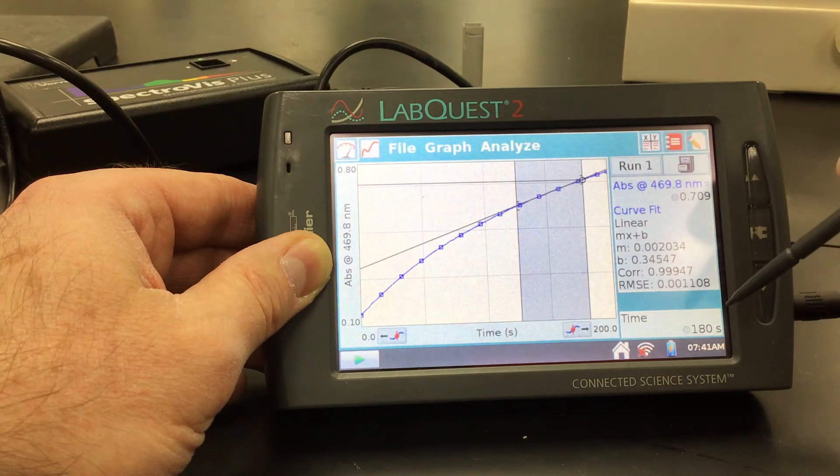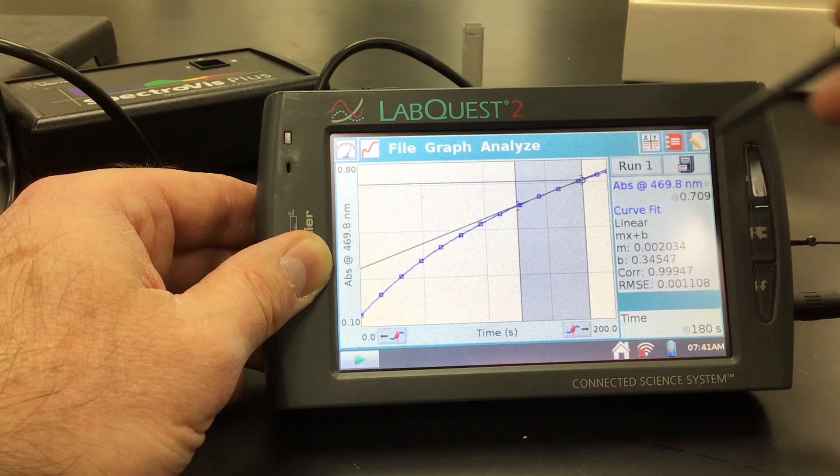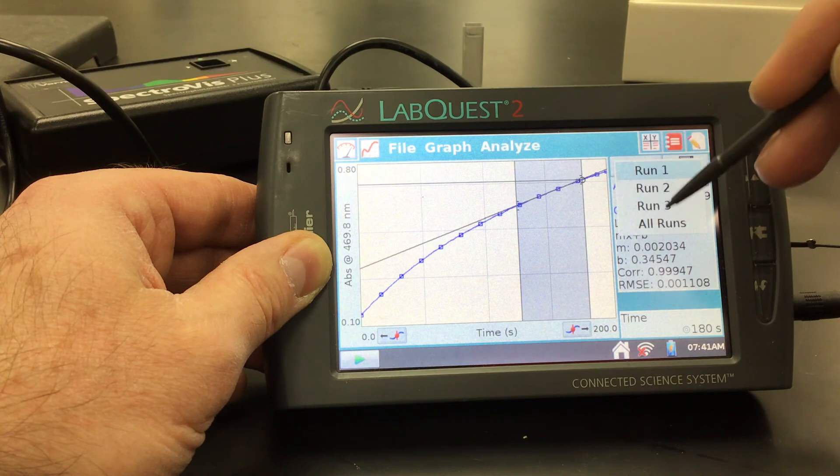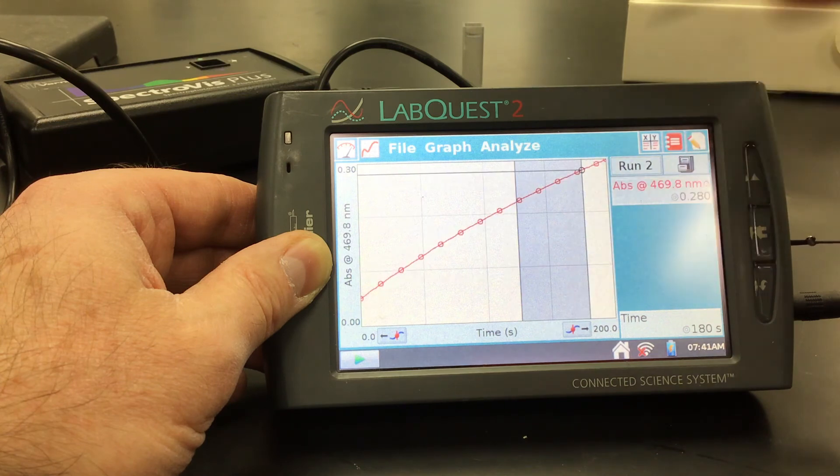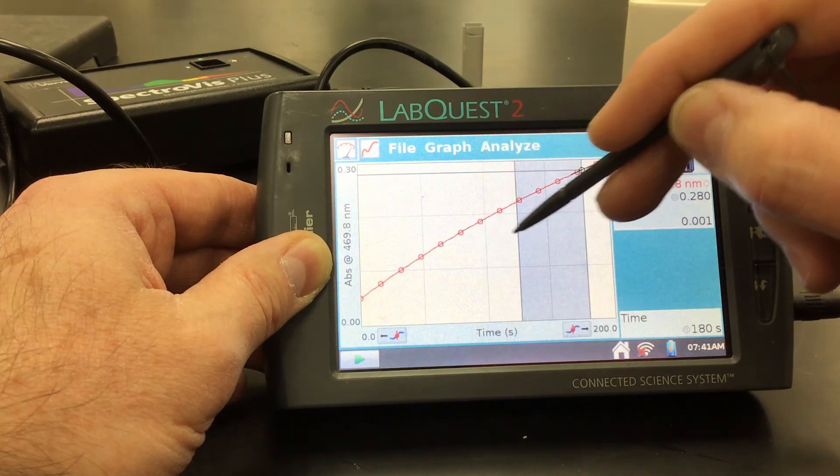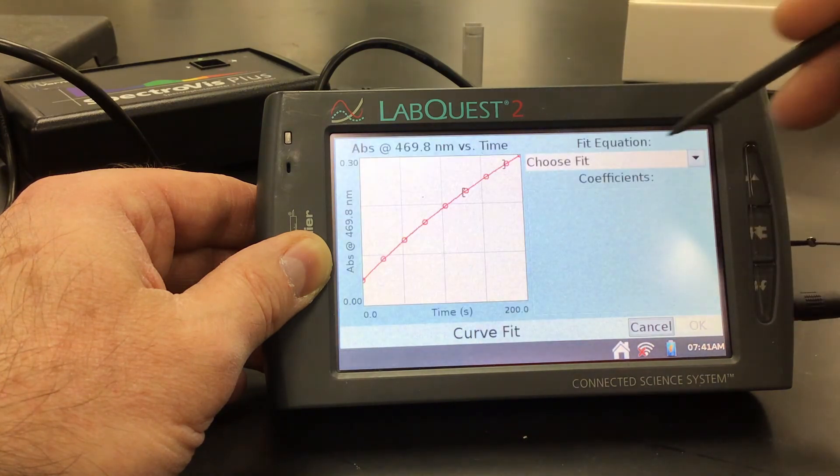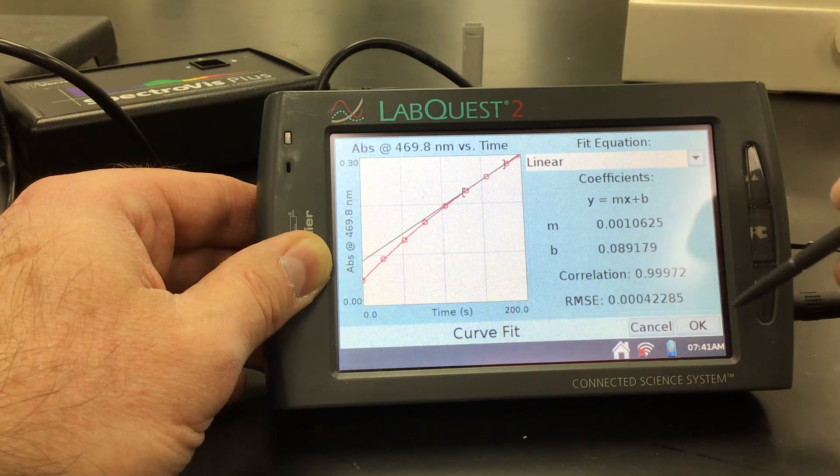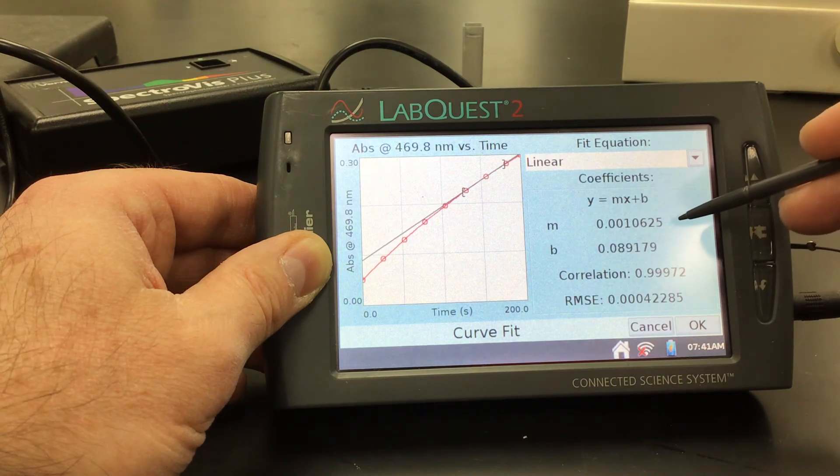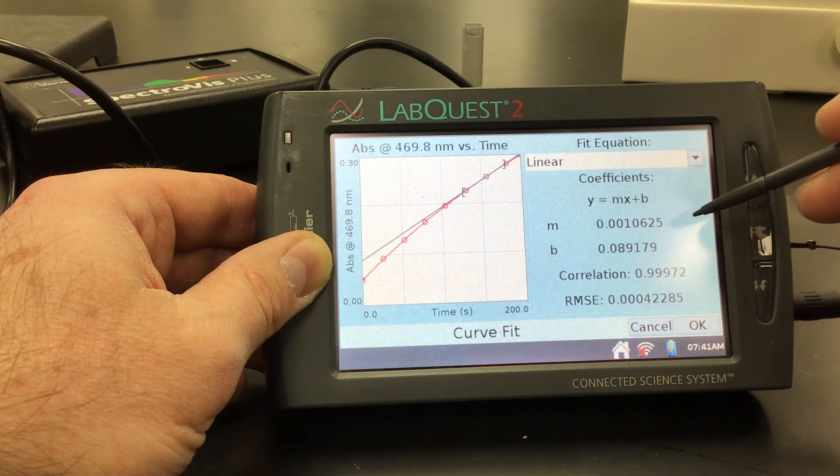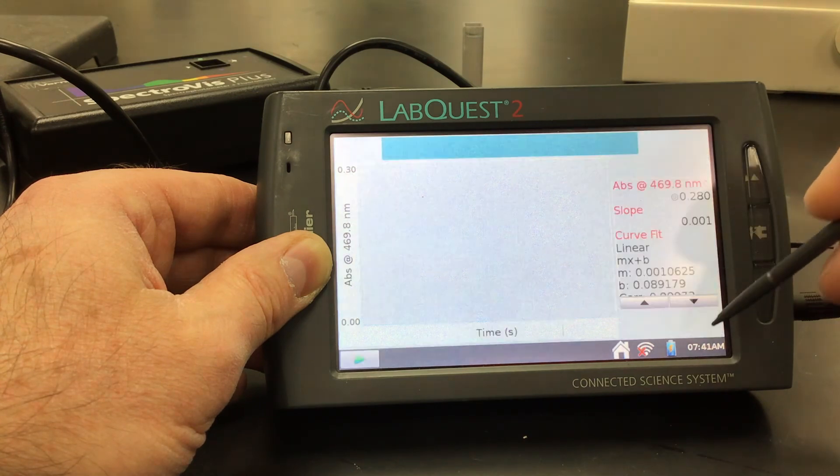All right. So that's one that we want to record. The lab quest saves it for us. If we look at run two, we also want to do that same thing where we do a linear fit. So let's do a curve fit of that and make it linear. And we want to record that value as our slope of our second run, which is our initial rate. All right. So 0.0010625. Okay.